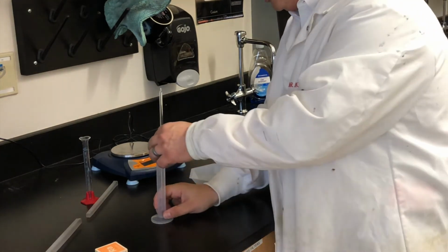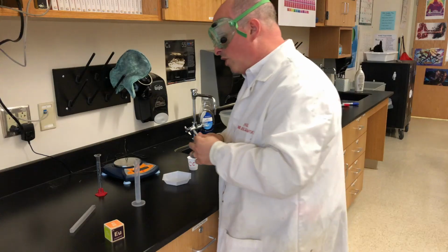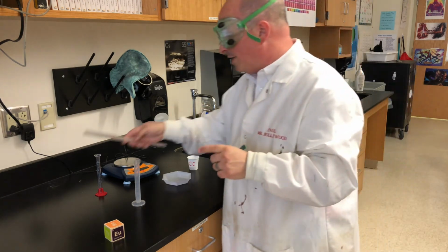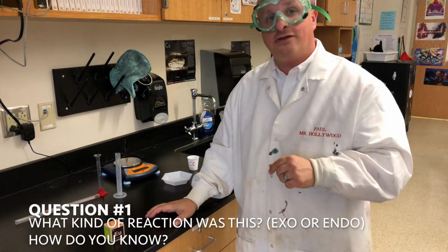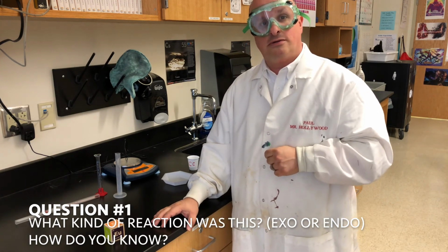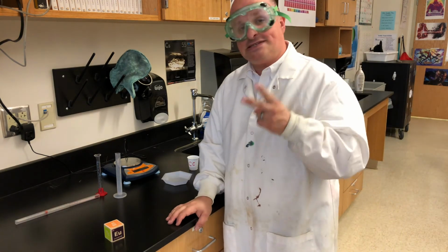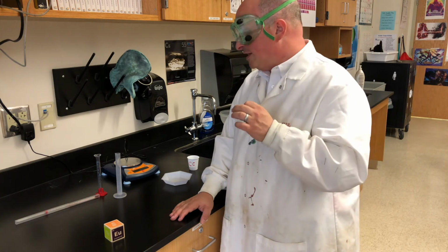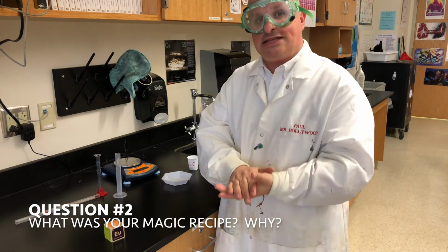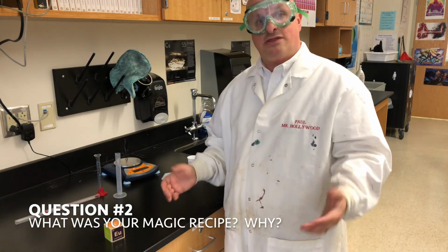And when you're done, you're going to clean up by rinsing everything out, returning it to the state you found it in. You're going to answer two questions as part of this lab. So make sure you know the answers to these two questions. Number one, what kind of reaction was this, exothermic or endothermic, and how do you know? And the second question you have to answer is, what was your recipe? How much calcium chloride and how much water did it take to get the maximum change in temperature? And why do you think that was the right amount?